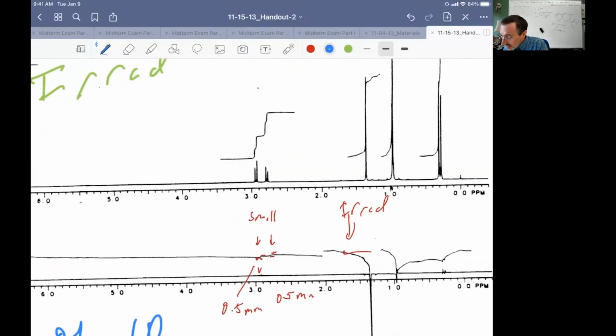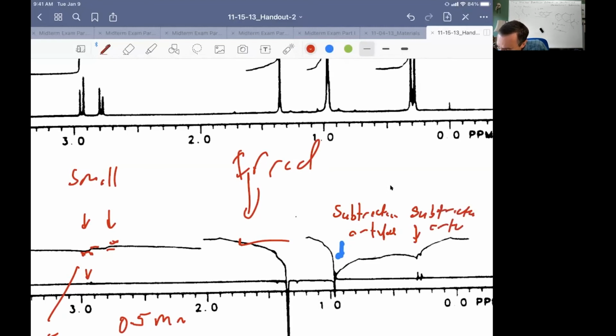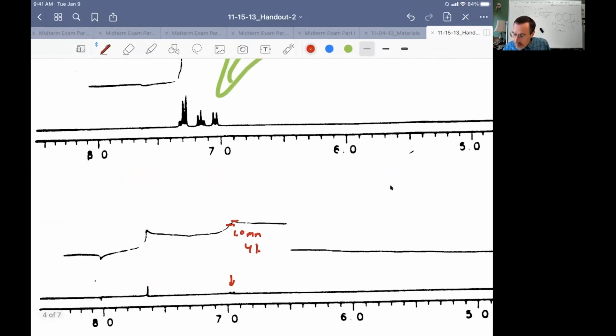So, basically I tried my best to get a look here. And it looked like this was a subtraction artifact. You notice we go a little bit down and up, but there's really no net change. It looks like these are subtraction artifacts. So I pretty much found every NOE that I could possibly, and this looked like an artifact. That looks like it's just another artifact.